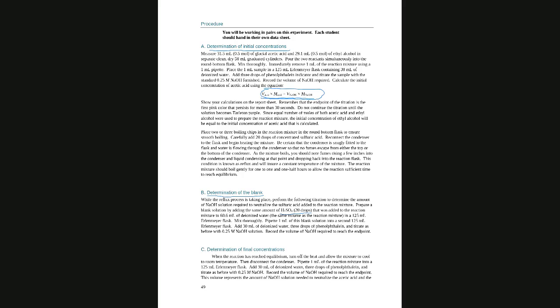For the blank, all we are interested in is to record the volume of sodium hydroxide. We are not going to do any calculations, because we are going to subtract the volume of sodium hydroxide needed to neutralize the blank. So for part B, we are only interested in the volume, no calculation for part B.